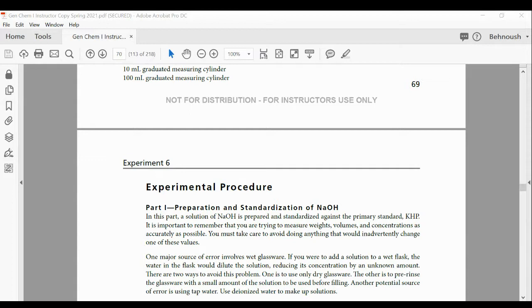And because it's a slow reaction, it's better to add an extra strong acid, HCl. Add about 10 milliliters of HCl at a higher concentration, maybe 1 molar or 2 molar. You give time for the reaction to happen, because a weak base with the strong acid HCl is going to react fast, and you just give it time to react completely.